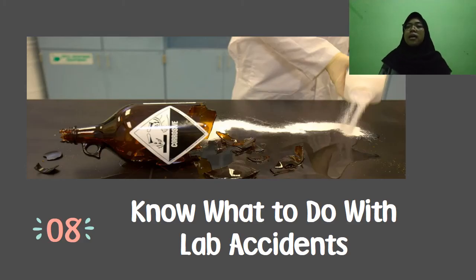Accidents happen, but you can do your best to prevent them and have a plan to follow when they occur. Most laboratories have a plan to follow in the event of an accident. One particularly important safety rule is to tell a supervisor when an accident occurs. Don't ever lie about it or try to cover it up.